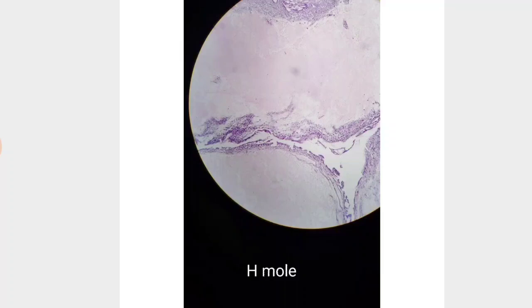As we finished the microbiology practicals, we are now starting with pathology practicals. I want to go through all of the slides and show a few characteristic features of each.